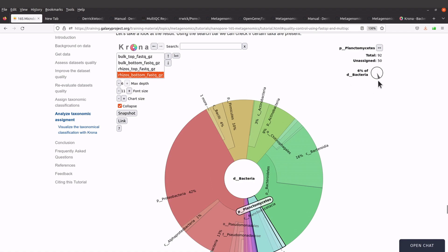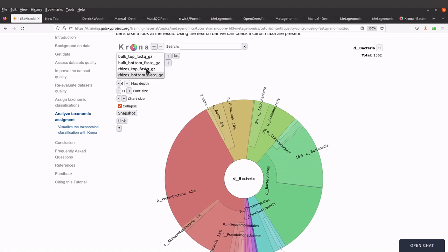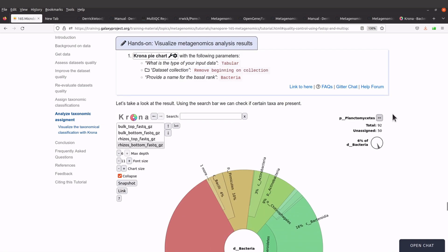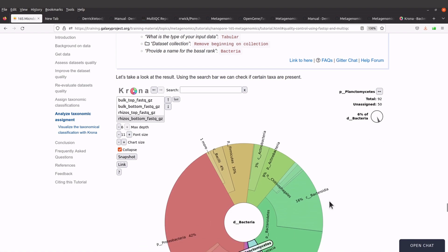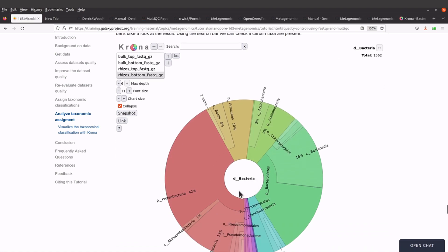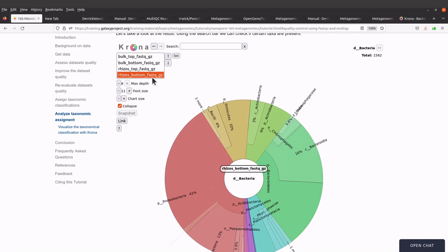If you don't see the value, just click to undo it, then search for the phylum Planctomycetes in the list and click it again — the percentage will appear at the top right. To remove the annotation, click it again and it disappears. So we have 8% for rhizos top and 6% for rhizos bottom.